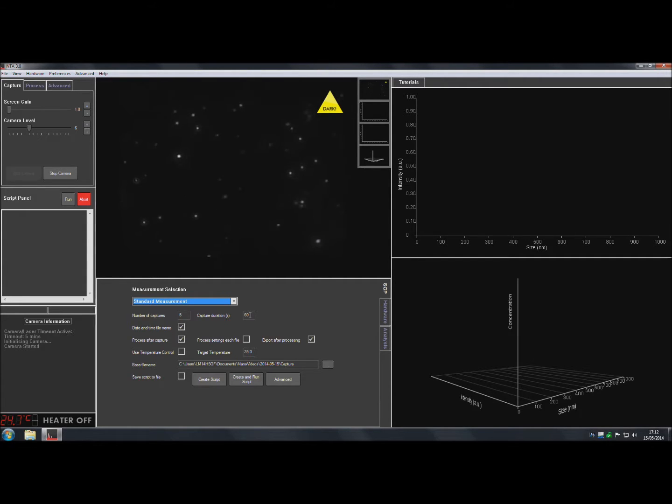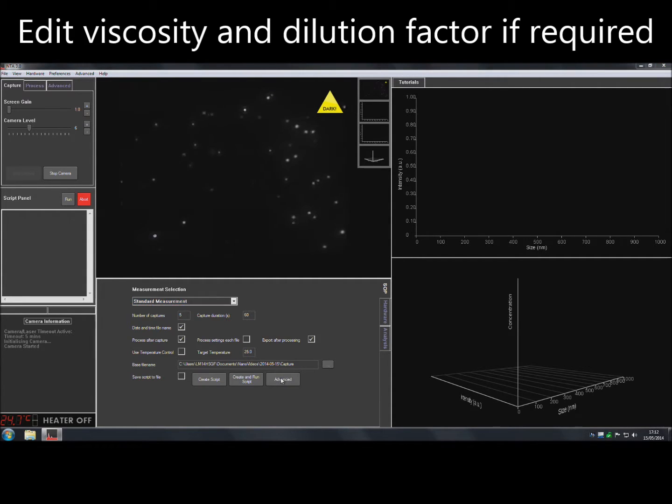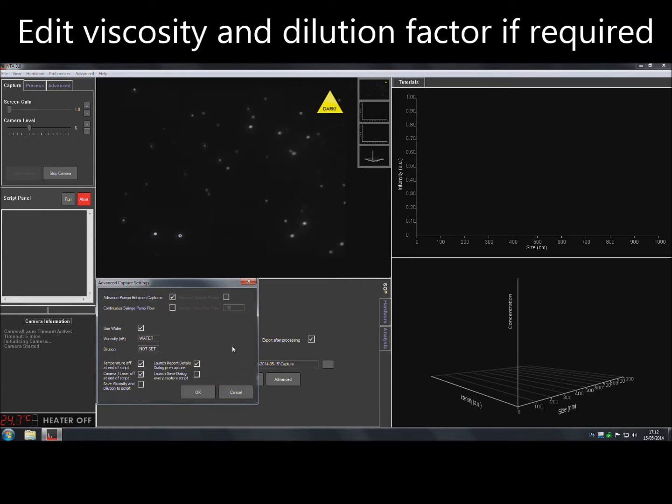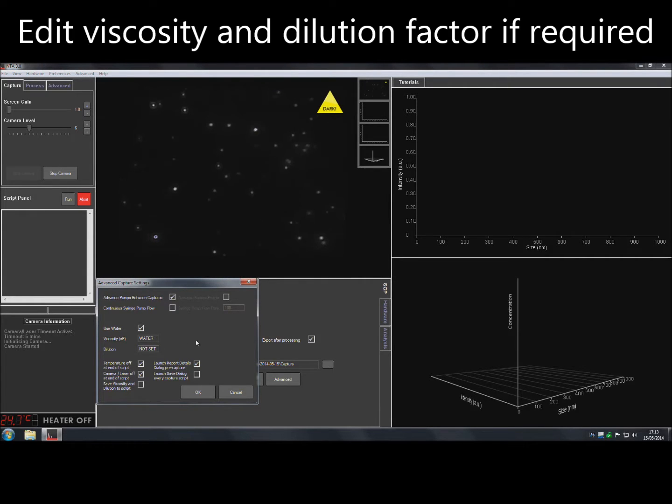To adjust the solvent viscosity or to add a dilution factor, select Advanced and enter the required values.